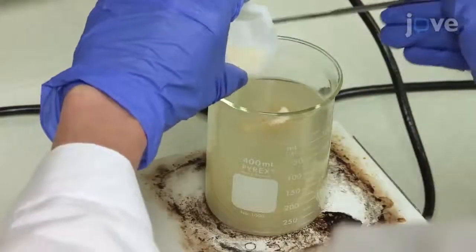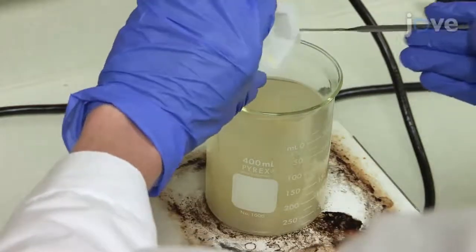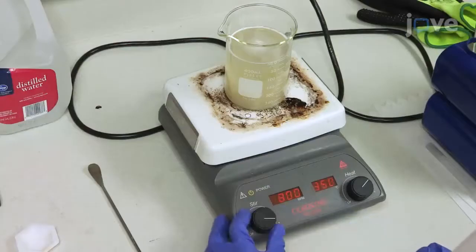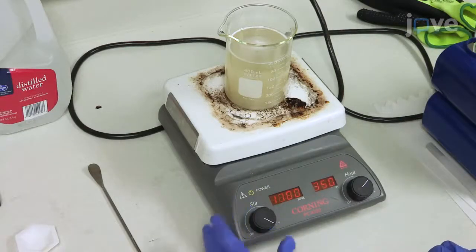Then, slowly spoon the 9.0 grams of agar with a spatula into the beaker with water. Once everything has been added to the water solution, increase the hot plate temperature to 350 degrees Celsius and stir bar speed to 1100 rpm.